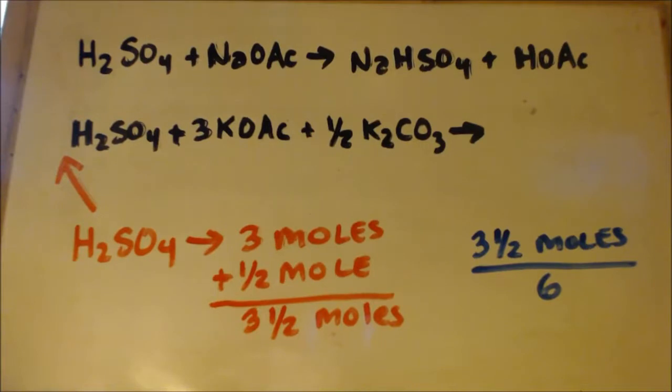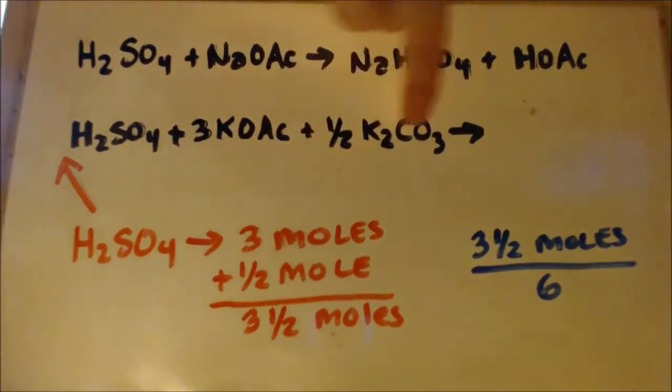Alright, if you're going to use this just to make acetic acid, you're going to drip sulfuric acid on the potassium acetate salt. I have sodium acetate, but same thing. You can have this option. You can basically just evaporate all the water off, and you would have potassium acetate and potassium carbonate. You can see down here I have both of them there.